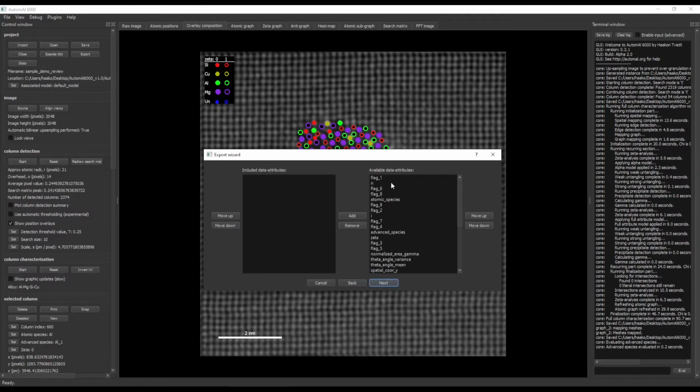And then here are some options, attributes which you can add to the data. Some of these are a bit outdated and deprecated, but I think the most important one that people will most likely want is I, which is like a unique index.